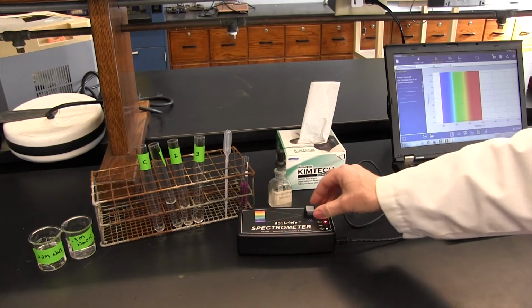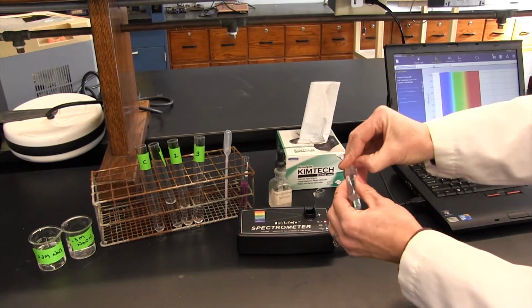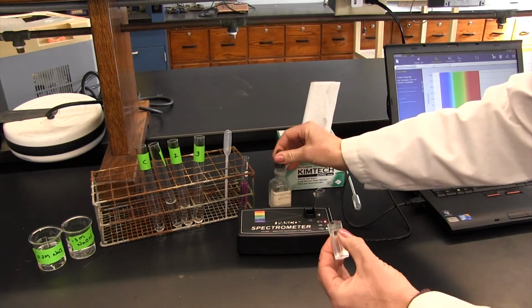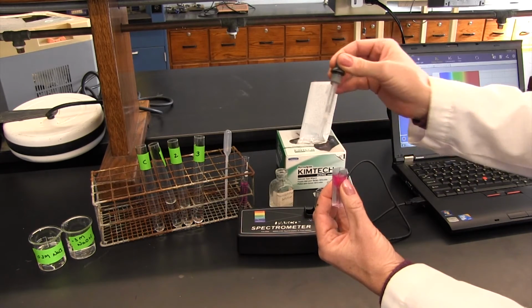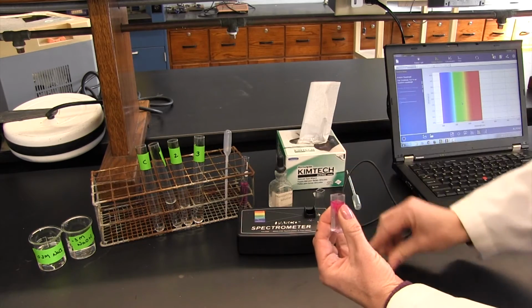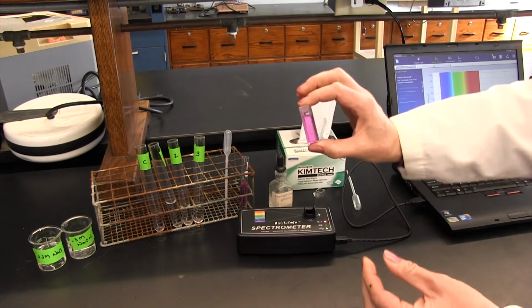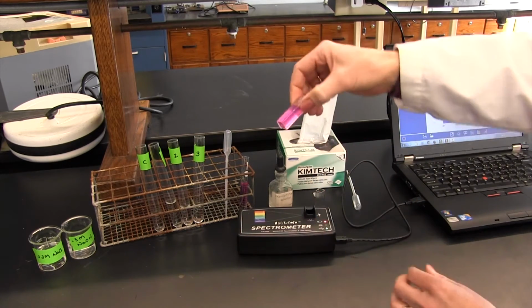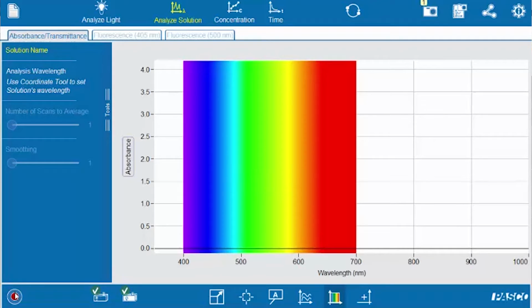All right, so now I'm going to remove the cuvette, and we need to add some of our phenolphthalein solution, because the next step is to figure out exactly which wavelength we should be using for our spectrometer. So I just shake it, I insert it in the correct way, and I hit the record button.